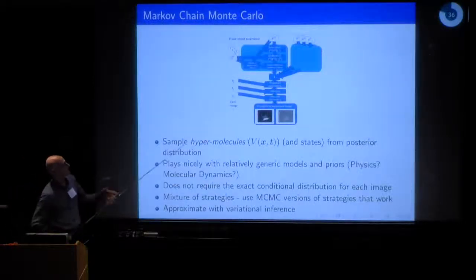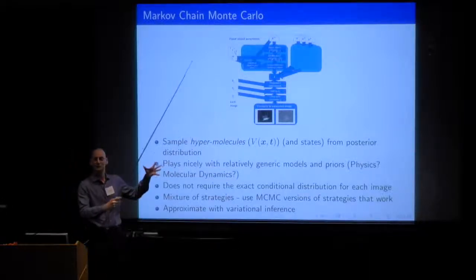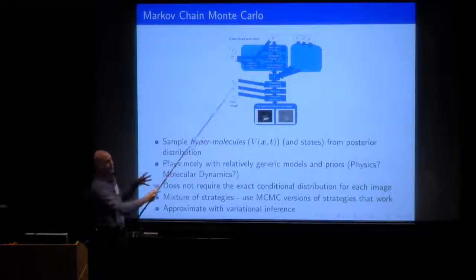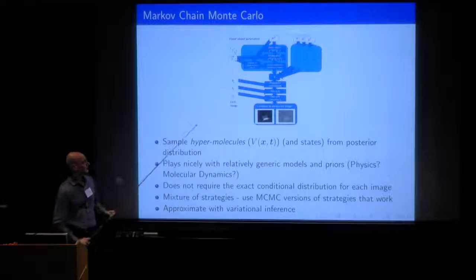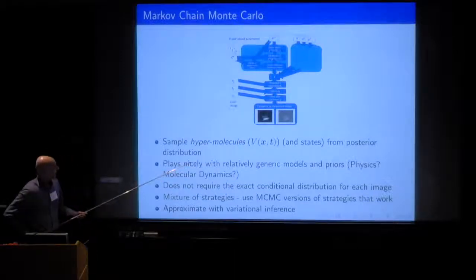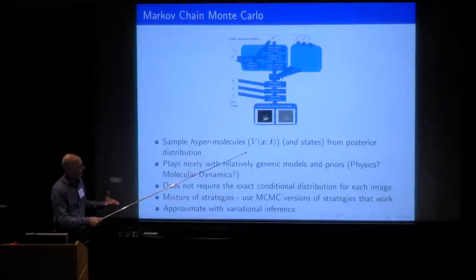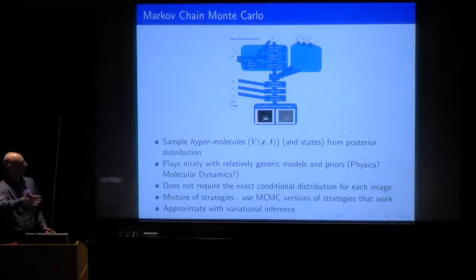And what we're building is this idea of putting together models that are sort of generic. They're not completely generic yet, there's software engineering in it, right? But they look at several different objects, what they can do, how they can behave, the relationships between them, and all the different variables that control them. It's not that complicated to add additional priors on, for example, how the CTF behaves between different images. Then what we do is we try to sample hypervolumes and their state from these posteriors. And so that's what we're doing now.